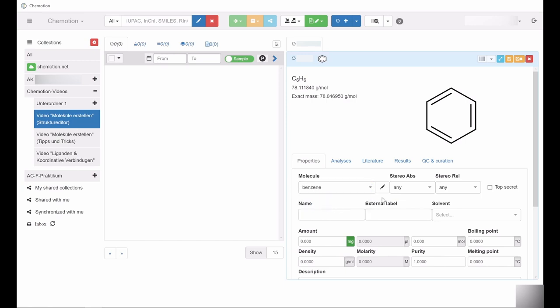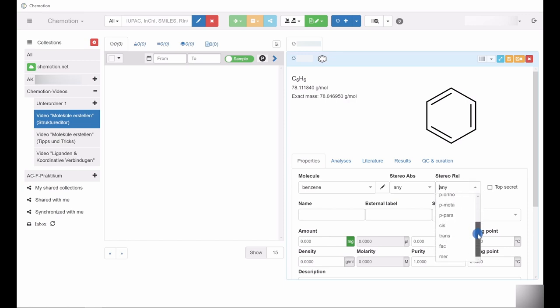Besides the name, you can specify the relative and the absolute configuration.